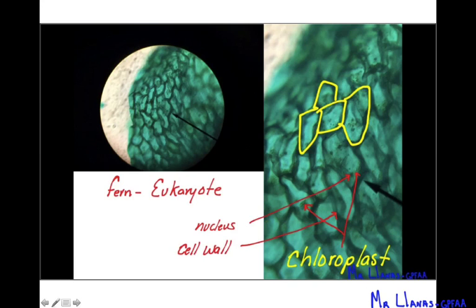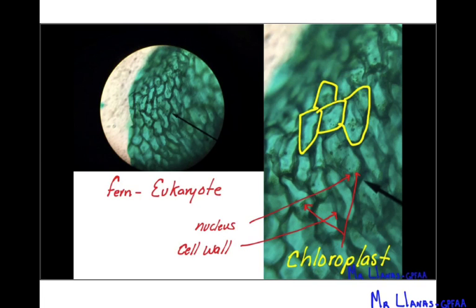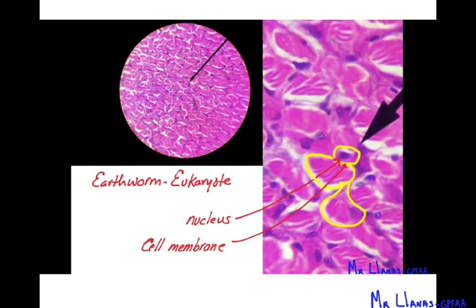This one has the nucleus in there. This one is empty, but those are xylem cells where water goes through, so they need to be empty. Okay, the next one is going to be a fern and a leaf, and you can see the structure. Those dark areas on there are going to be the cell walls. If I go around here, this is the cell wall. Okay, and then you can see the dark spot there. That's the nucleus, and then all the little see-through bubbles that you guys saw on the microscope in lab are the chloroplasts. Okay, so that's a plant cell.